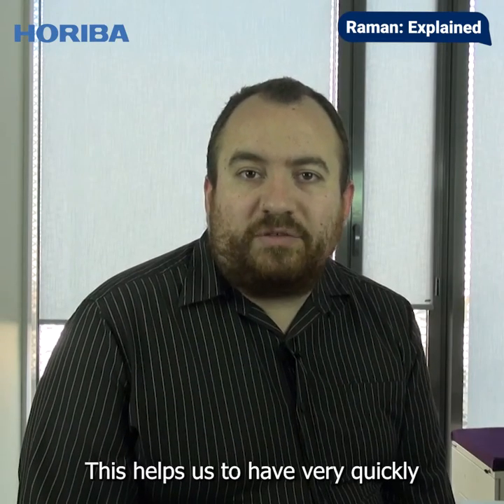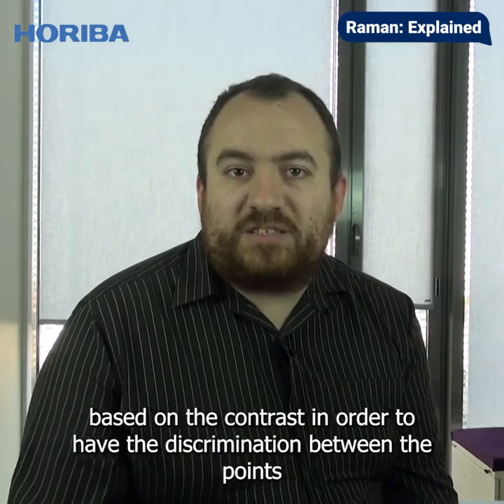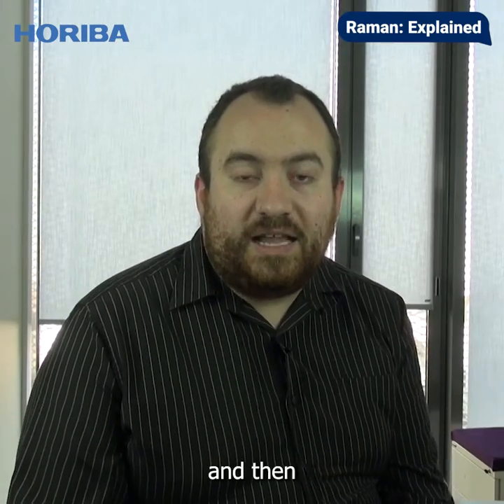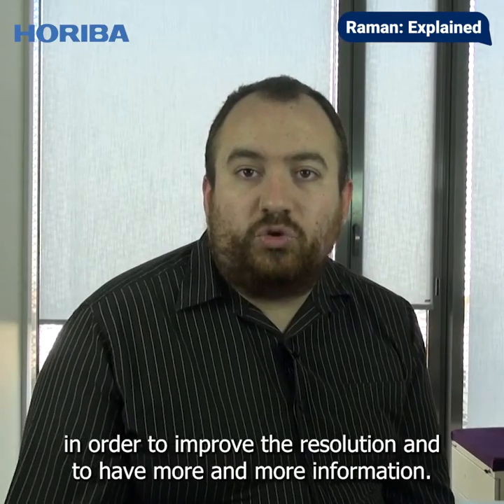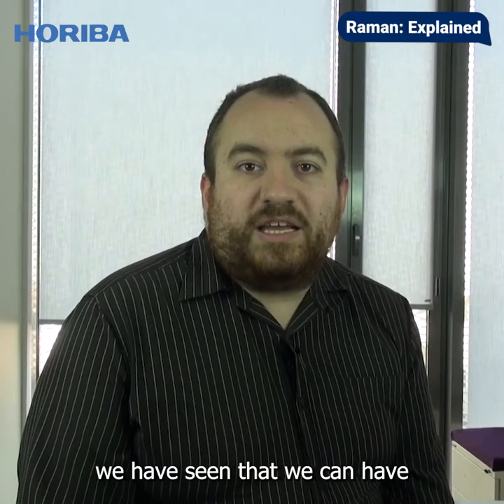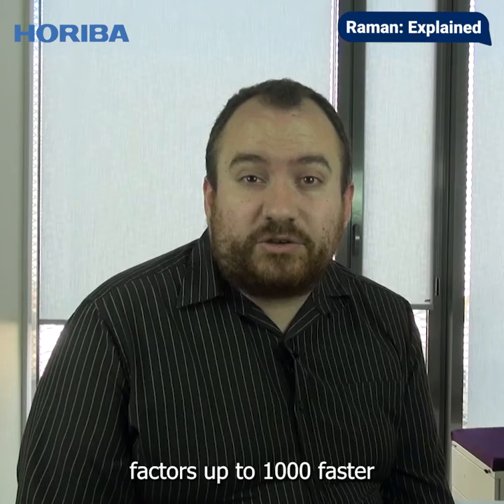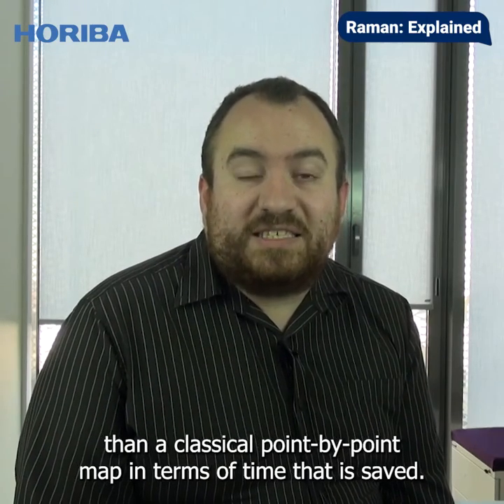This helps us to have very quickly a first image of the full area that is mapped, based on the contrast, in order to have the discrimination between the points. And then we will just add more and more points in order to improve the resolution and to have more and more information. Based on our experience with smart sampling, we have seen that we can have factors of up to 1000 faster than a classical point-by-point map in terms of time saved.